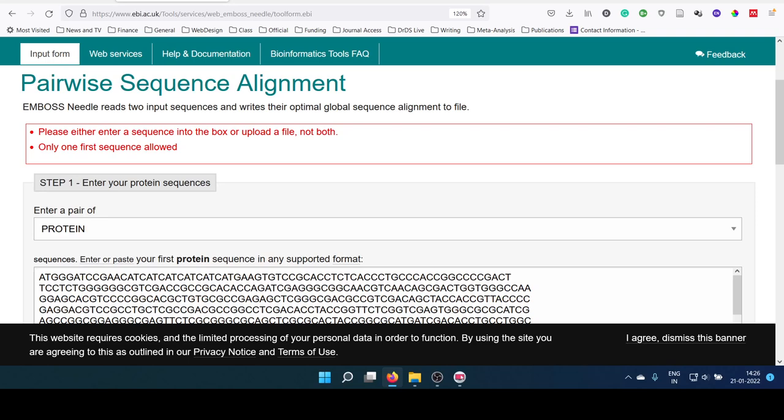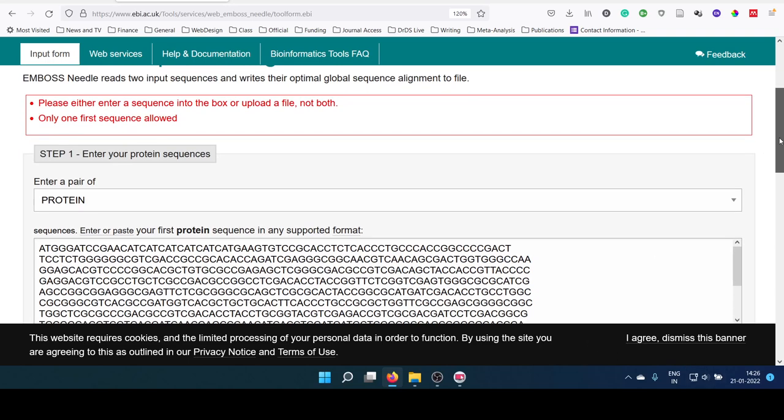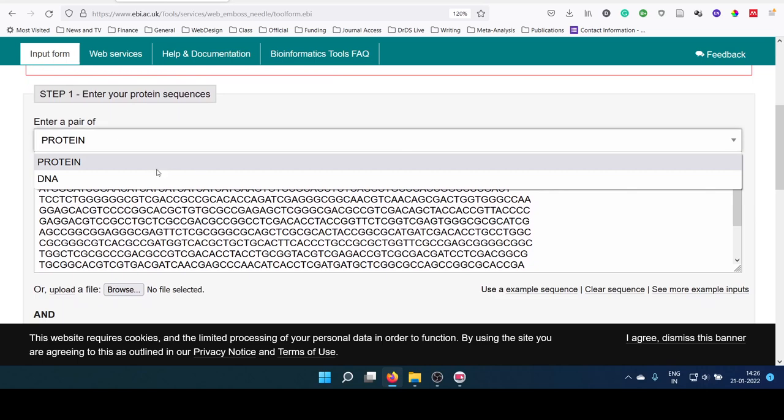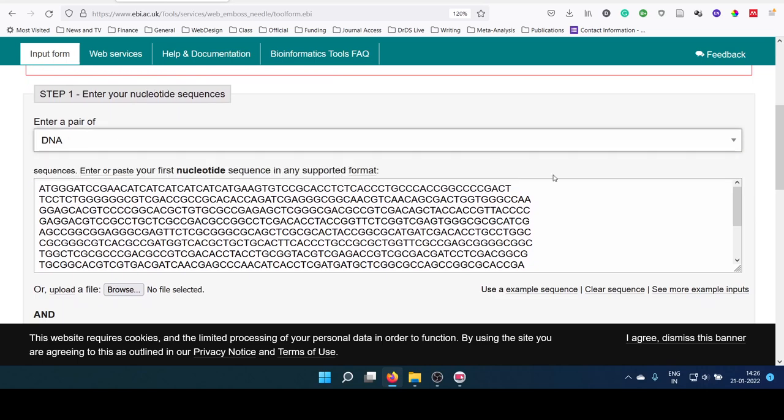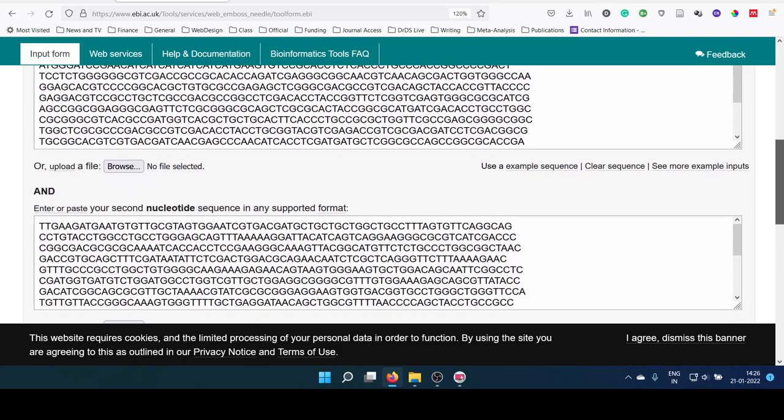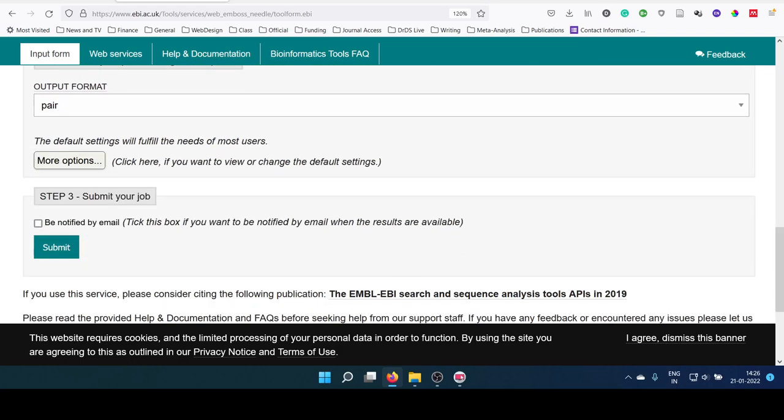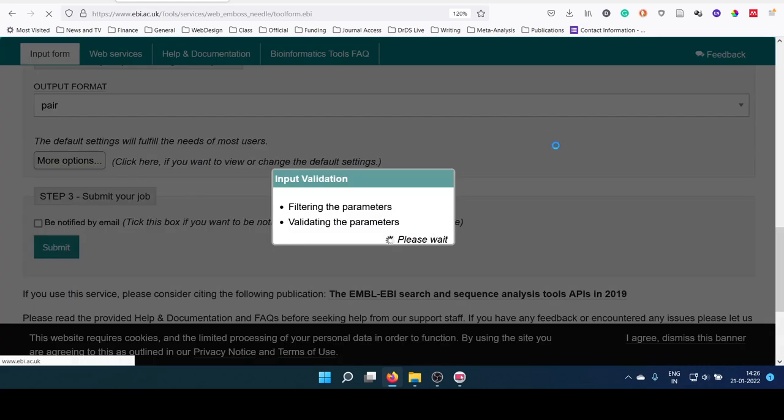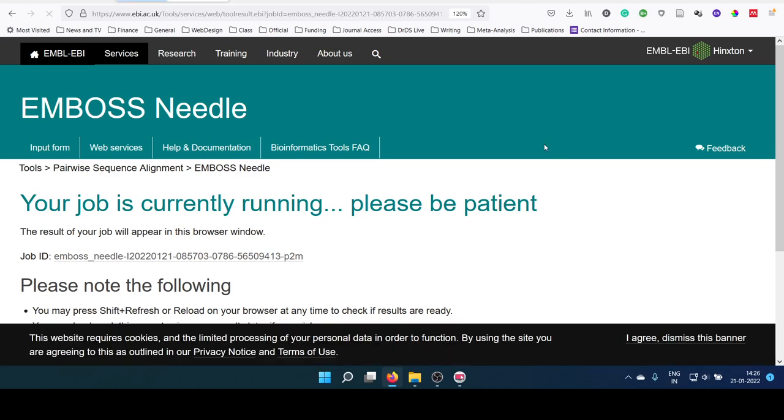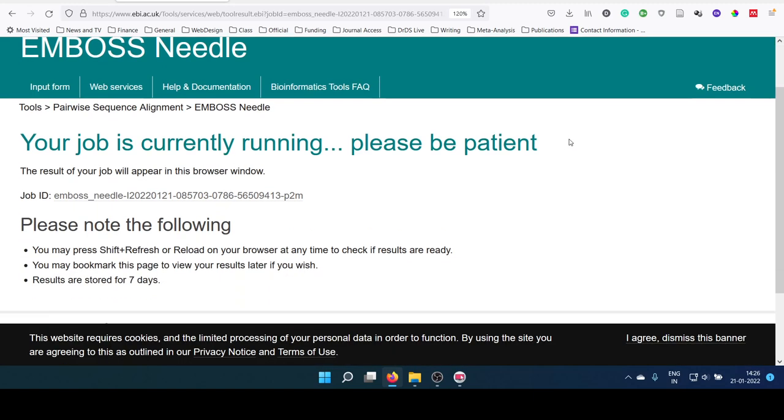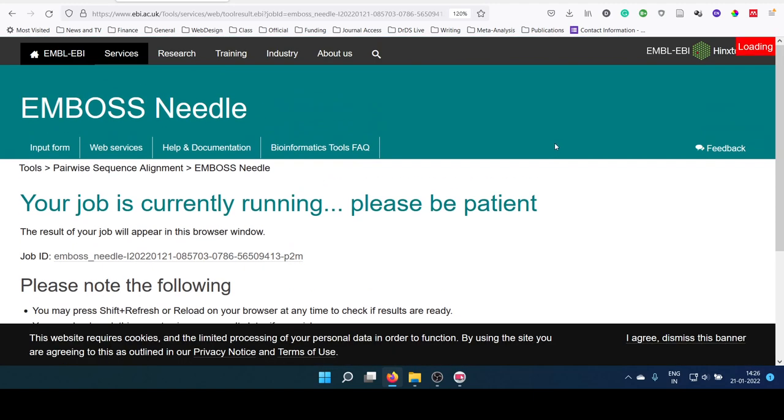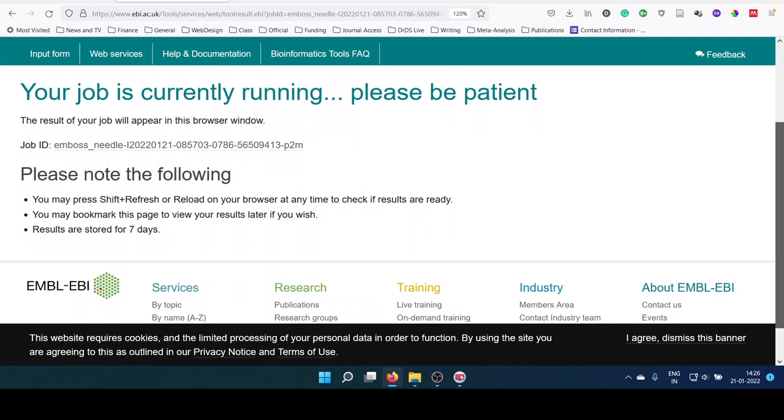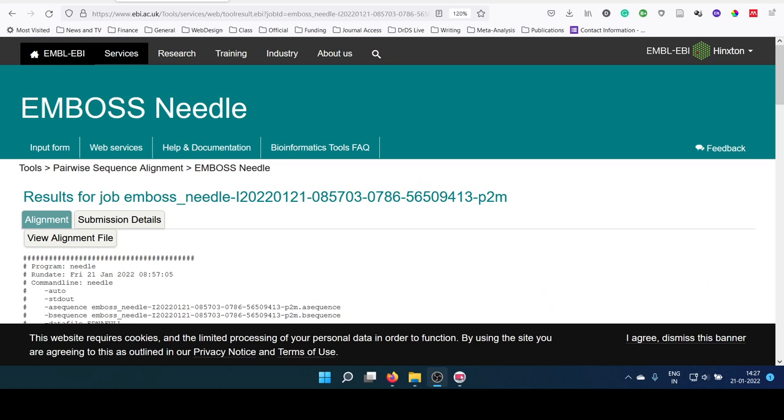Sorry, this is a DNA sequence. Now you have the results here.